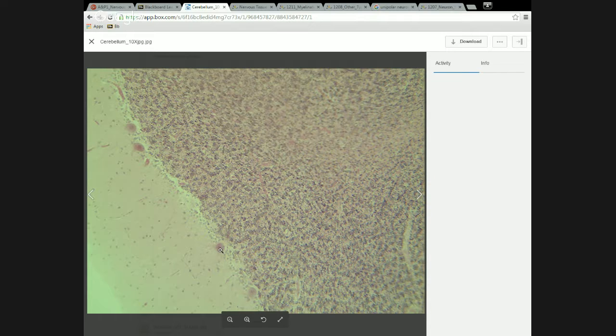And then in between, we have some big cells that we can make out. Now, these two happen to be fairly close together, and then there's a big gap until we get to the next one and a medium gap here. They're spaced at kind of irregular or random distances. In 3 dimensions, we would see that it's a fairly tightly packed layer of cells. Not as tightly packed as the granule cells, but they actually are pretty close together. We just happen to be cutting through an area right here where we don't see any other cells, just because we've missed them with the knife.